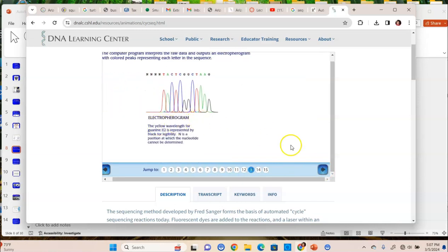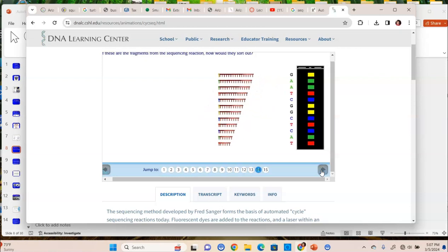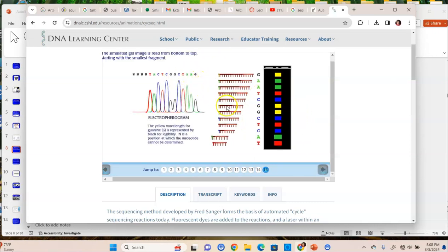Then we get the electropherogram, which we talked about, and then the computer will reverse complement that to give us the exact sequence of those fragments so that we can know without a doubt what the sequence of the original DNA is. And those are the sequences that are published in PubMed. Remember, we always publish it in a 5' to 3' direction. And we always publish the coding strand, which is not the template strand, right? The coding strand is the one that matches the code for the RNA.